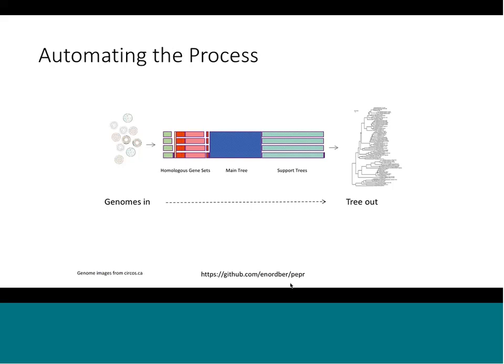So here's basically how the process works in PATRIC. You will choose a set of genomes. And from those genomes, we'll take all the genomes together and we will build protein families. And we will look specifically at protein families that each genome that you have chosen has at least one protein as a representative of that.